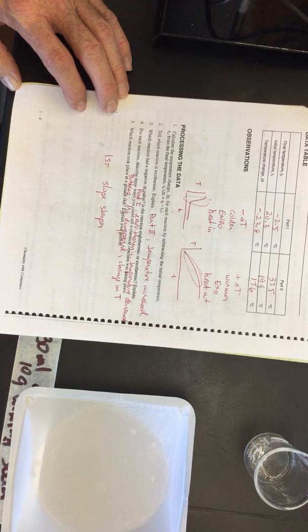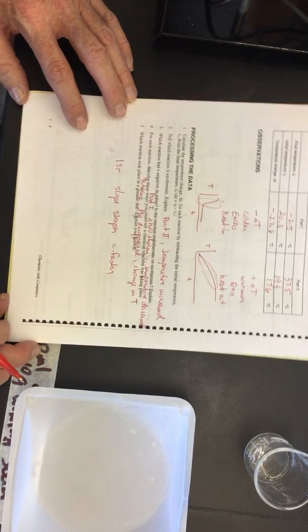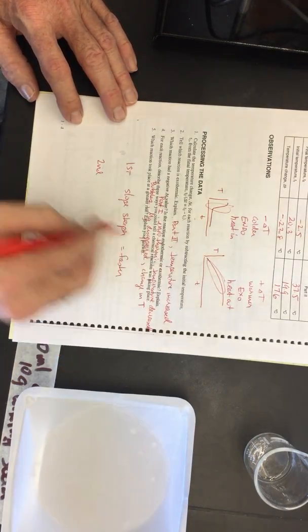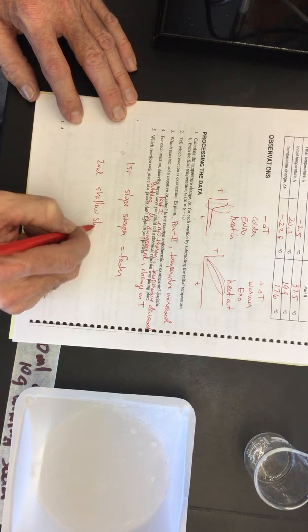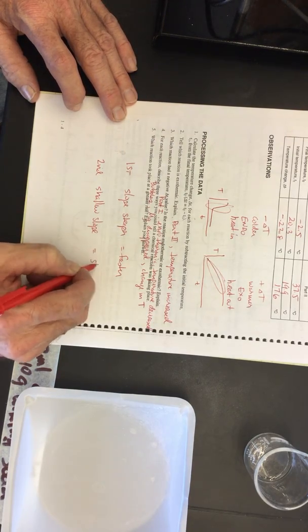We have a steeper slope, and so it goes faster. Let's take a look at the second one. The slope is more shallow. What does that mean? It means that the reaction is taking place slower.